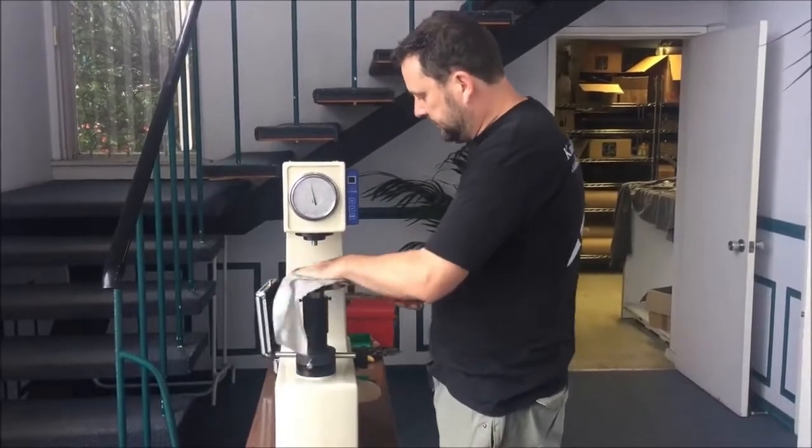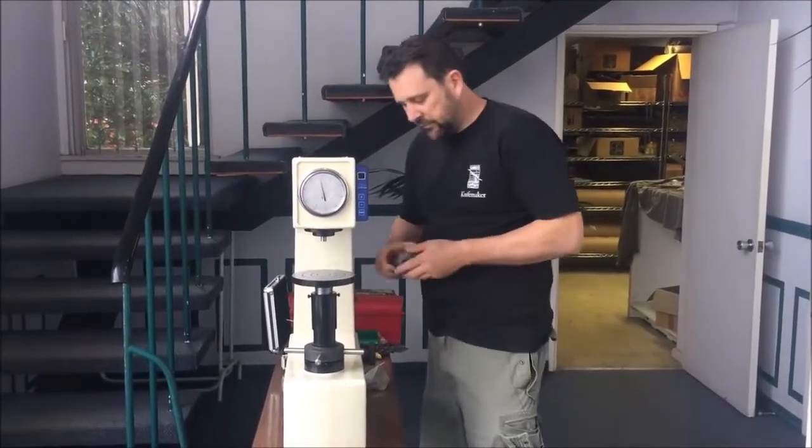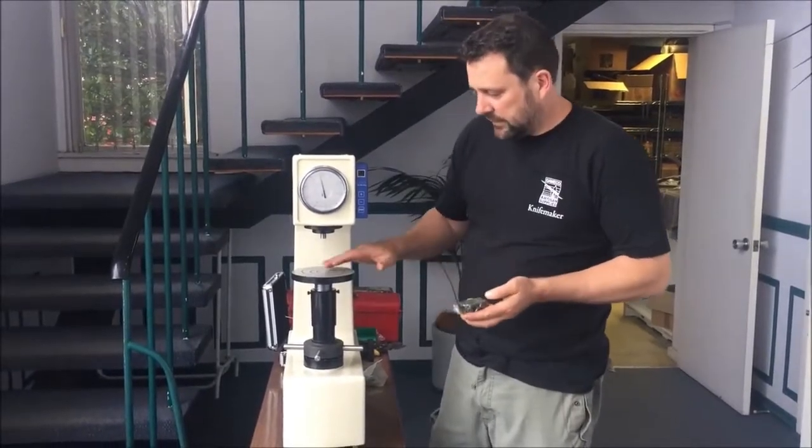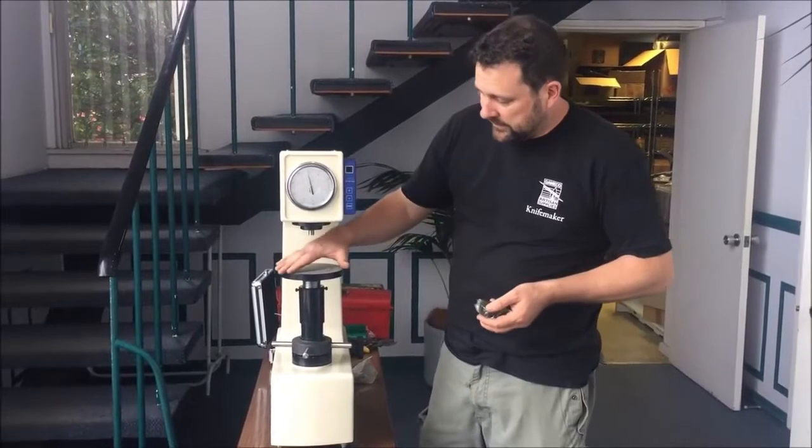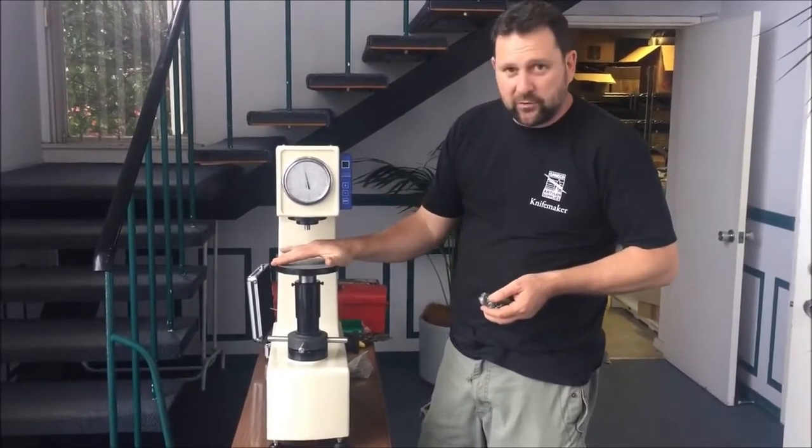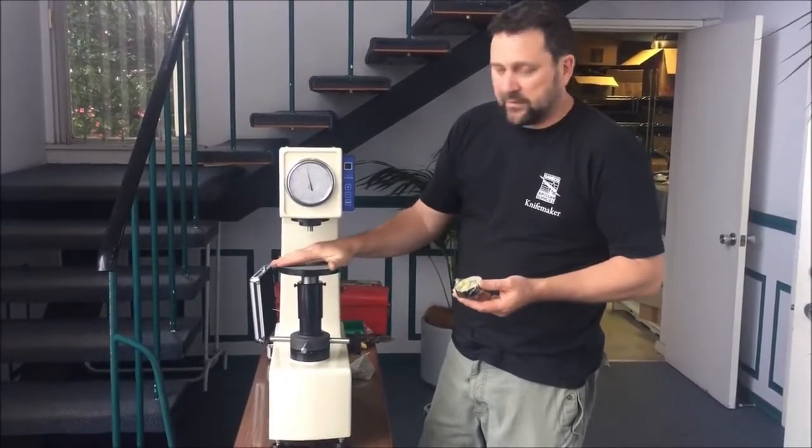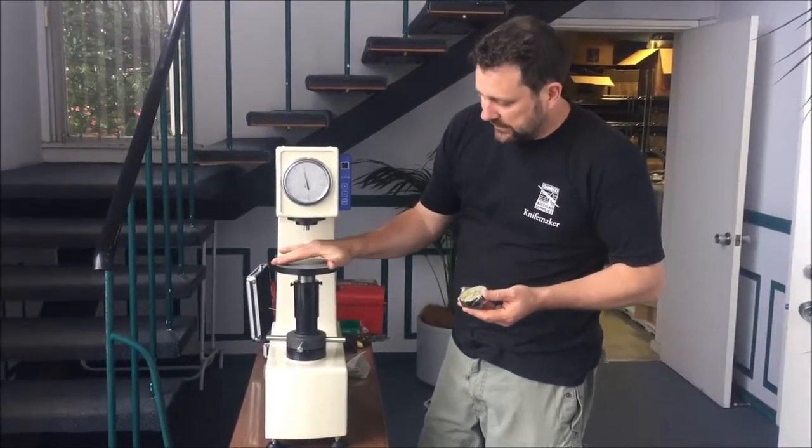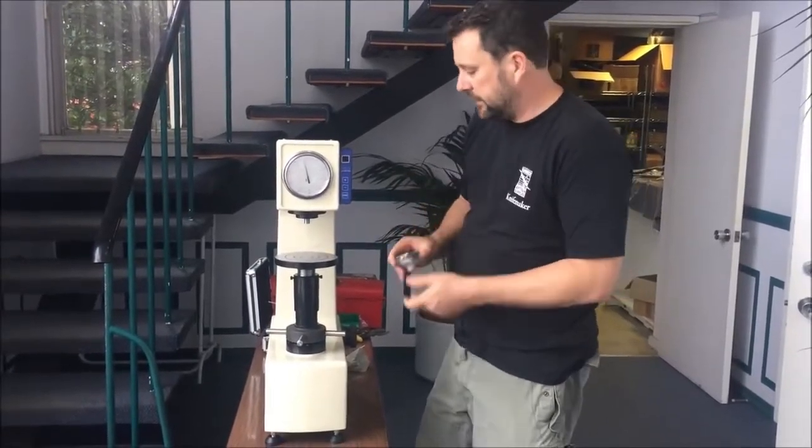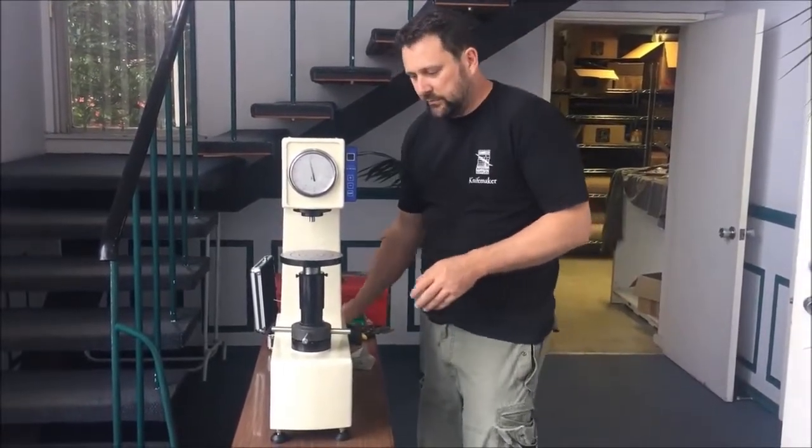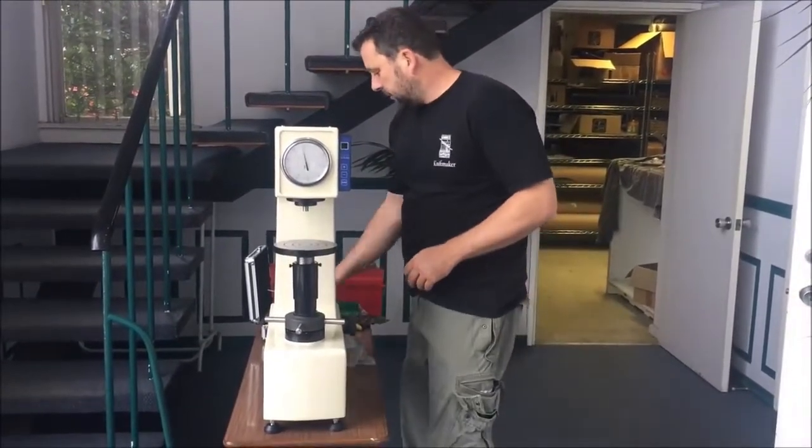Quick note on the anvils. For knife making I'd prefer this one, the smaller anvil, rather than the bigger one. Reason being is because we're testing other people's blades. If they've got a bit of a bow in them and it sits on the anvil like that, it'll read soft. If it's on a smaller anvil, it's much less of an effect, so you'll get more consistent readings. But that's okay, we'll leave the big anvil on for this.